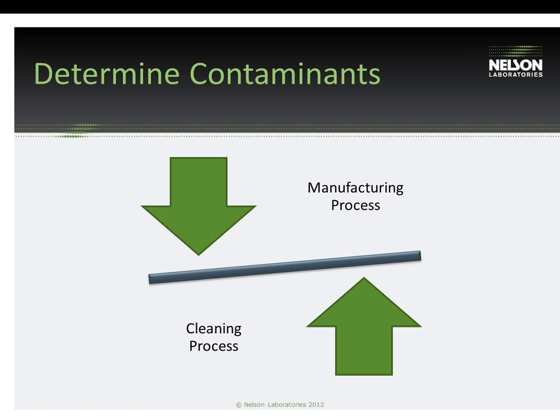And often for the validation, our clients will pick their worst case contaminants and focus on those for the validation. Also, it's common that our clients do not know what the potential contaminants can be. And in that case, we recommend trying to examine as many of the unknowns as possible to cover your bases, which we can also address later in this presentation.